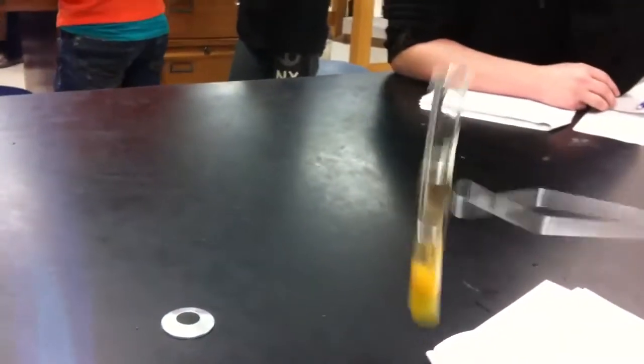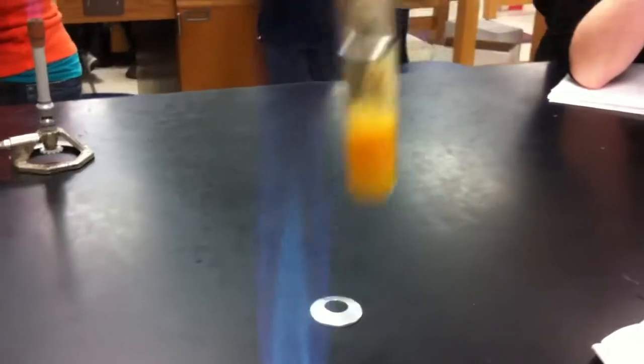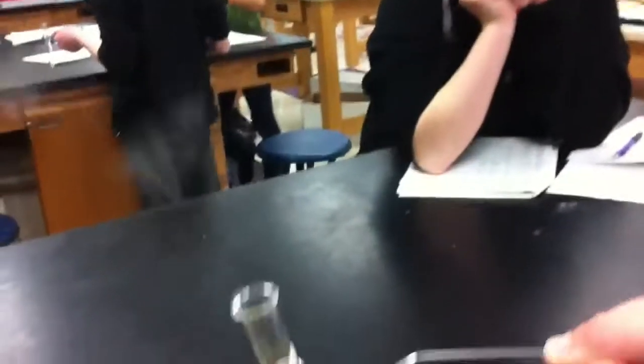Which one is that? Apple juice. It's pure sugar, pretty much. Boiling. Wow, that's a lot of sugar. I agree. Alright, let's turn this off.